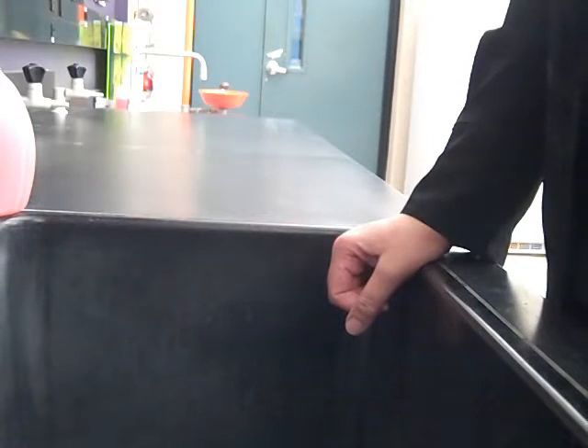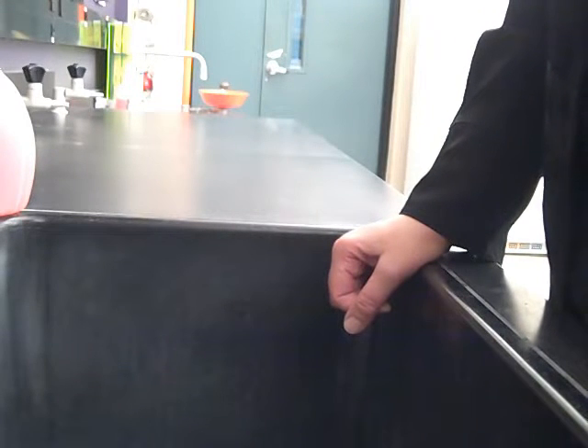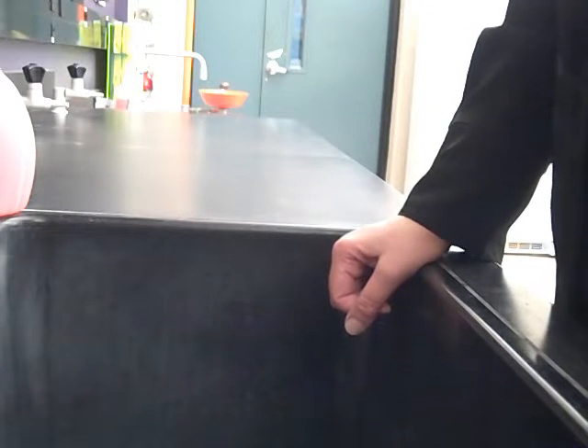You're going to wash your hands on the way into the microbiology lab and on the way out of the microbiology lab. A good rule of thumb is it should take 20 seconds — or about the time it takes to sing Happy Birthday twice — for you to wash your hands. Make sure you use a good amount of water and a good amount of soap.